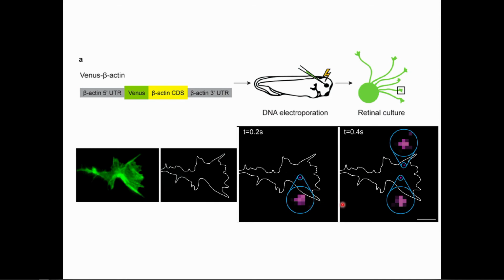So here's another example. In fact, what we've done here is we've developed a method that allows us to track how a protein is being synthesized inside the cell, and we get flashes of light, and the flashes of light tell us the protein has been translated inside this neuron. It's an axon here. In fact, this translation is taking place in the distal parts of the cell, and so we get a flash of light, and we know a particular protein has been made. In this case, it's a cytoskeletal protein. It's called actin. So we make a fusion construct.